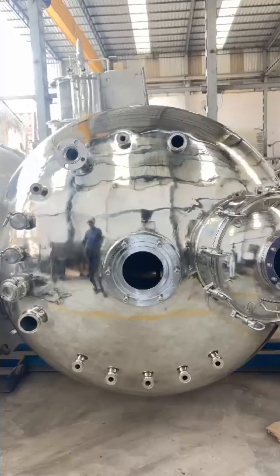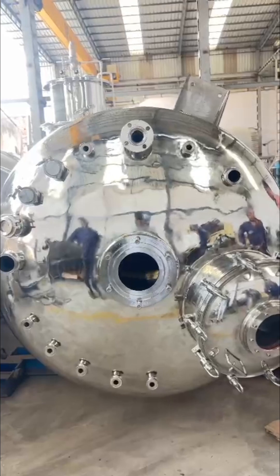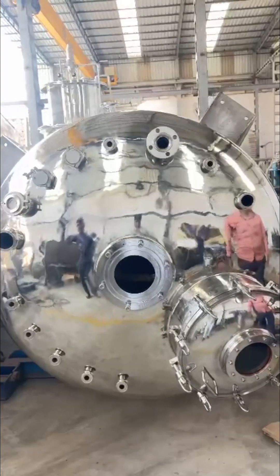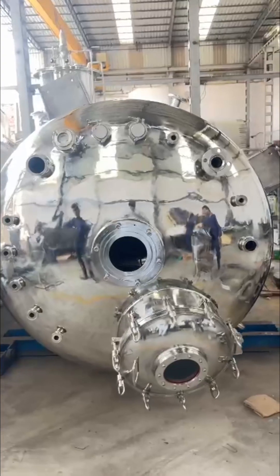The system stands firmly on four resting lugs, providing stability and open space at the bottom for easy maintenance. The heat transfer system uses half-pipe coils wrapped around the external shell, delivering highly efficient temperature control.